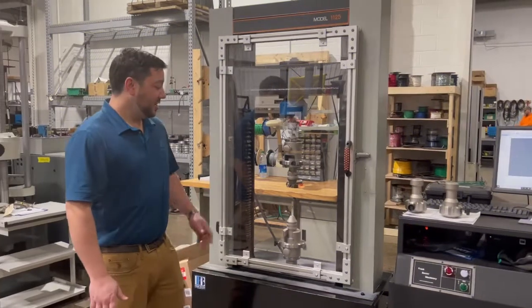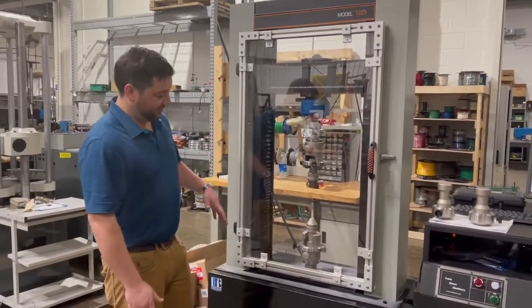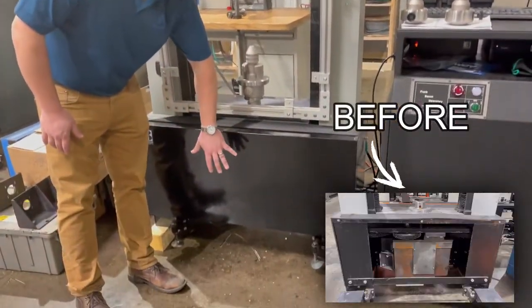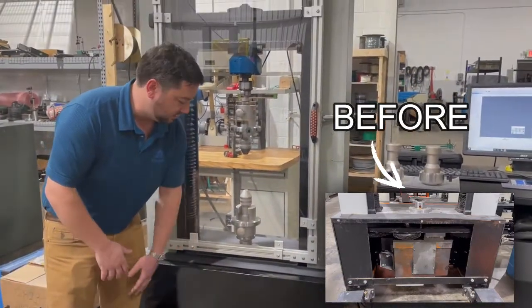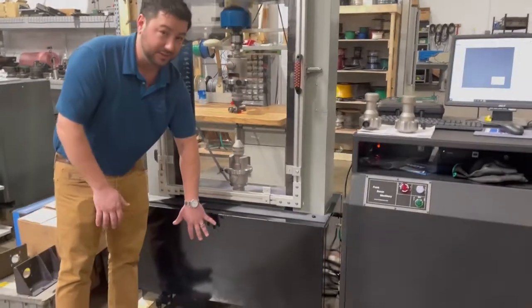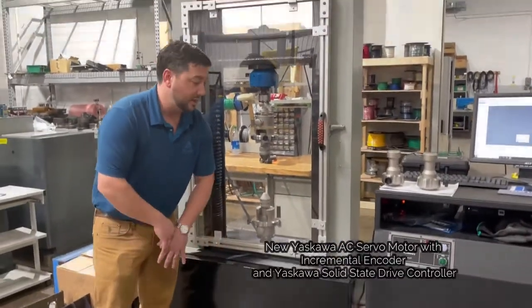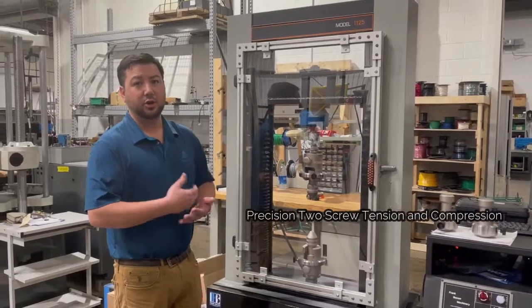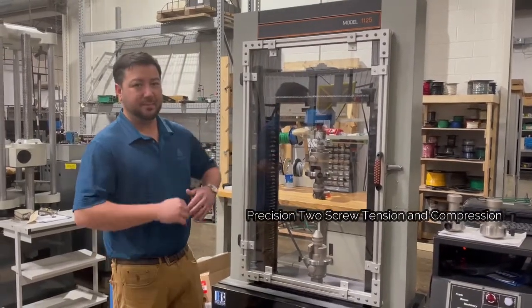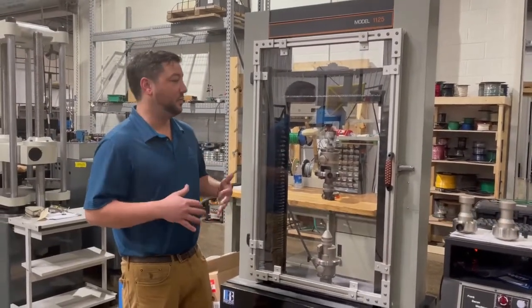Hi, Jeff here. So what we've done today with this 1125 is we've replaced this entire drivetrain. Previously it was a clutch two-gear setup. We've replaced it with a planetary drive AC servo motor — pretty much taken all the wear components out of this. Got it gear to gear, low tolerance all the way through: the most precise machine that we can make.